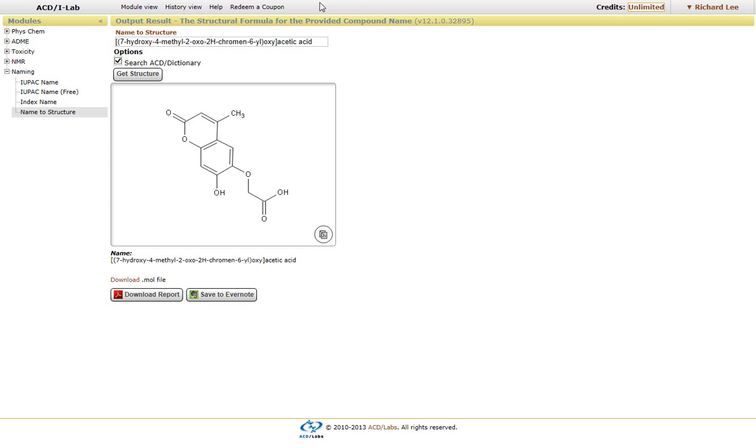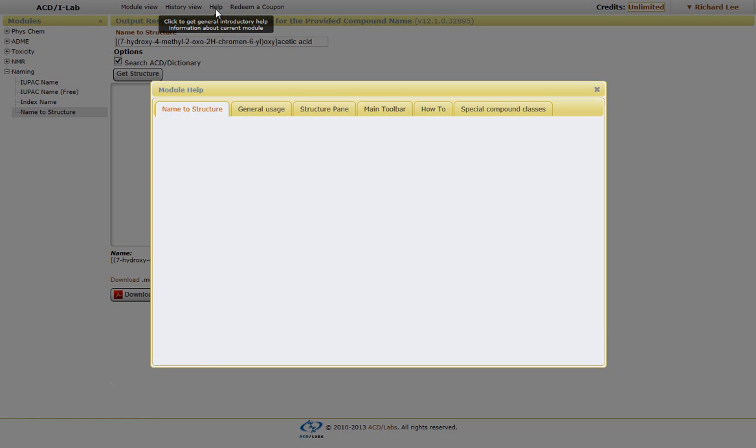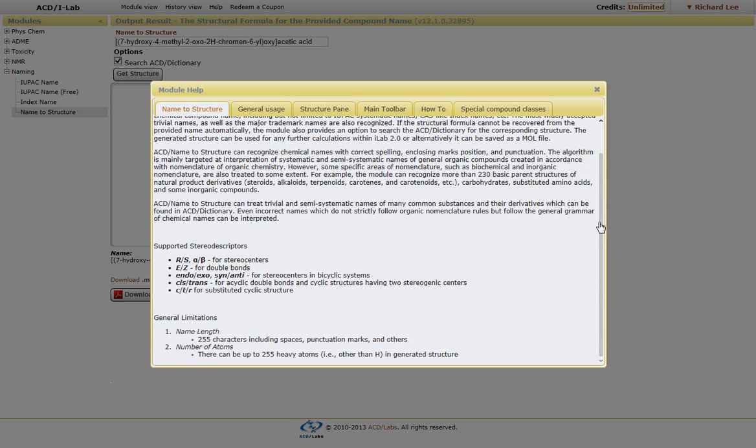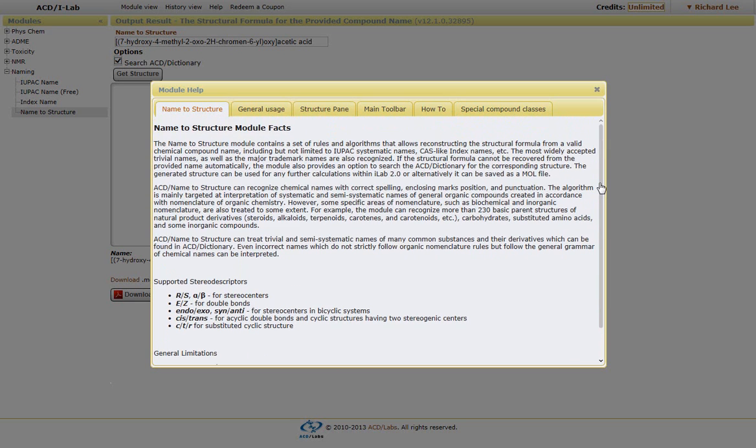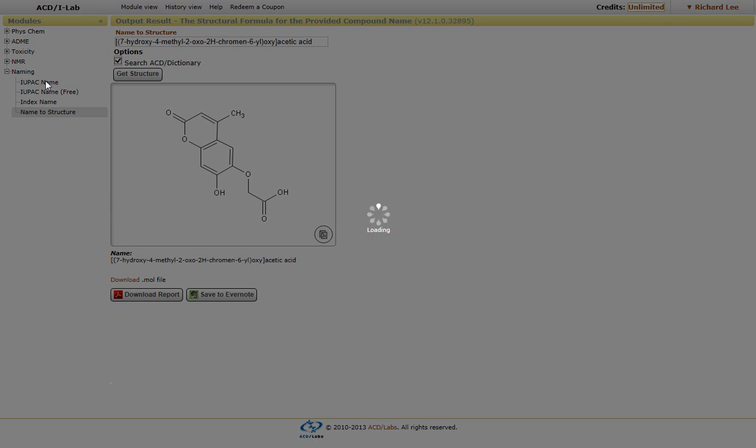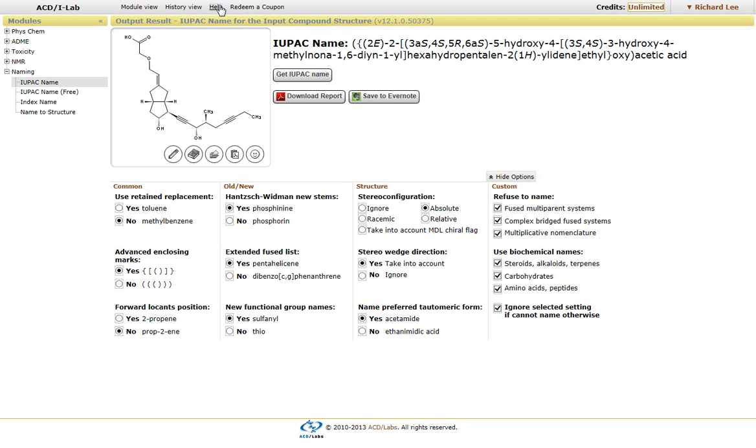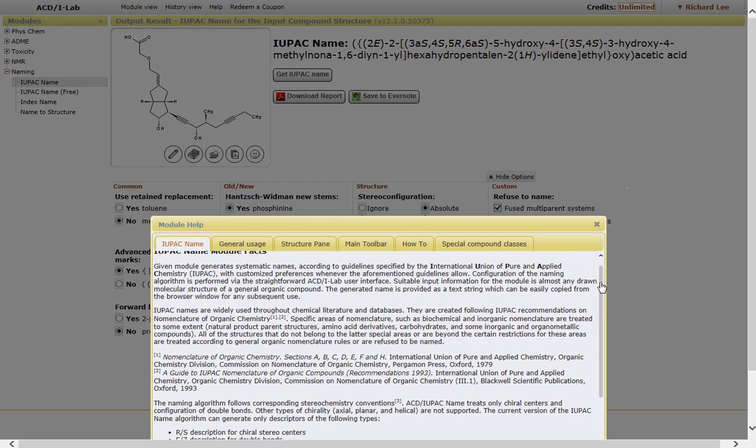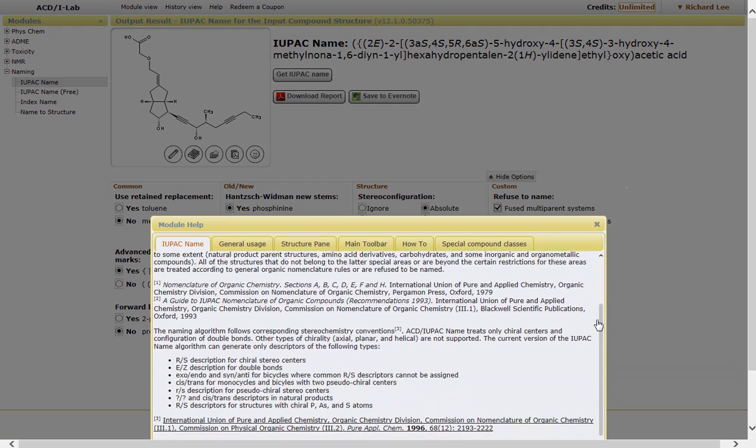If you want more information about the drawing module, you can click on the help icon. It gives you more information regarding the name to structure help menu. Or if you go back to the IUPAC name, there is more information regarding the IUPAC conventions that are used.